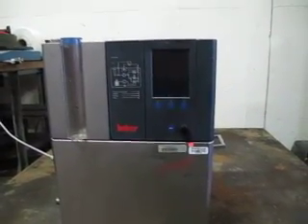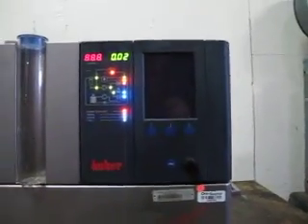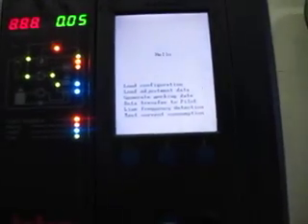We broke the on-off switch in moving it, but you can see it fires up and it goes through the test procedures.